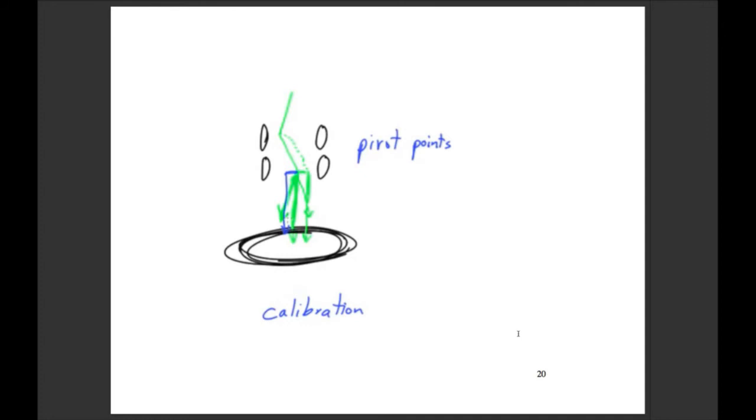It sets a point within the tilt of the beam so that you can control the deflectors so that they can tilt and shift your beam independent of one another. And so that's what a pivot point is. That's probably not very helpful for you unless you're looking at a microscope and what it does, but it's a very, very important alignment to do. Ed, Young-Z, I don't know if you guys have anything you want to add to that.